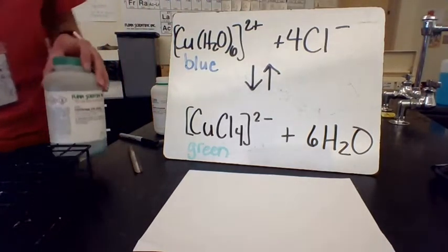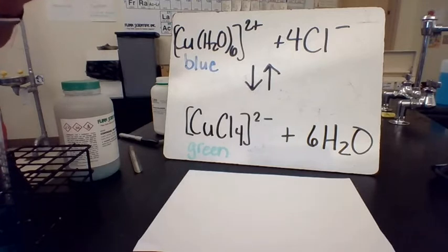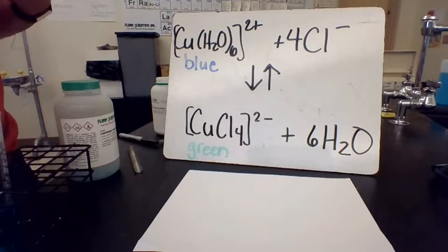All right, welcome. In this video, we are going to take a look at Le Chatelier's principle in action. So we're going to look at some different equilibrium systems, and then we are going to apply what we call a stress to the system and see if we can observe how the system responds to that change.